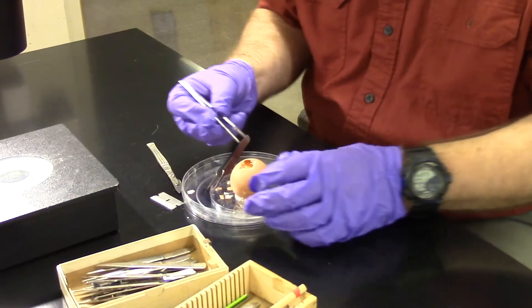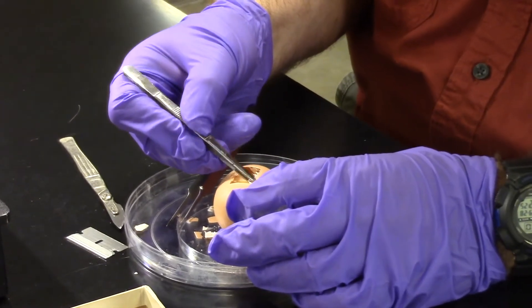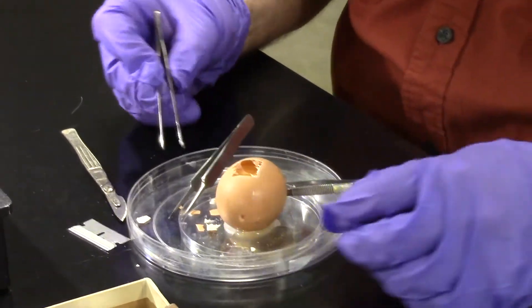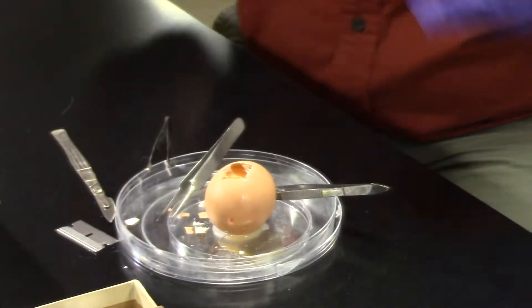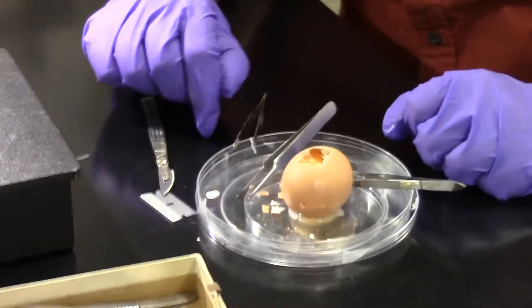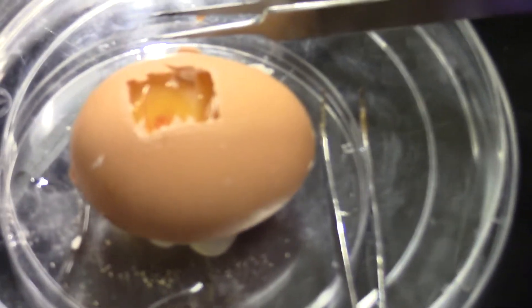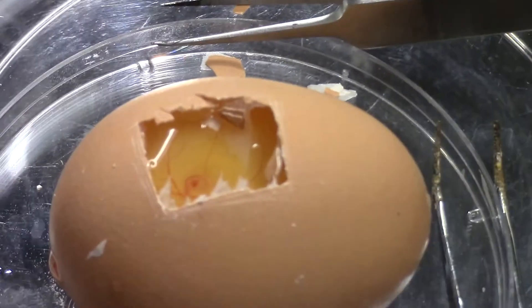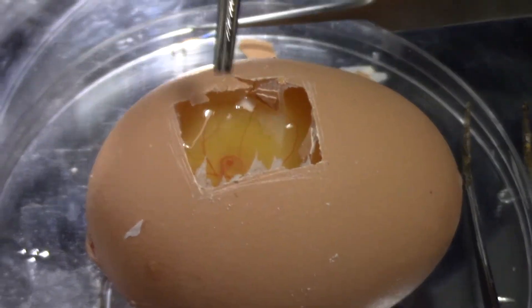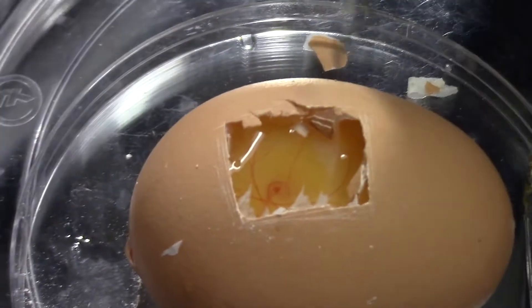Let me grab some fatter forceps and I'm just going to grab and pull. There we go. Come and look straight down in and we'll see the embryo itself. Do you see the little red spider? This is the head. The head has turned a little bit to your right. The legs are down there. And there are blood vessels coming off on each side.